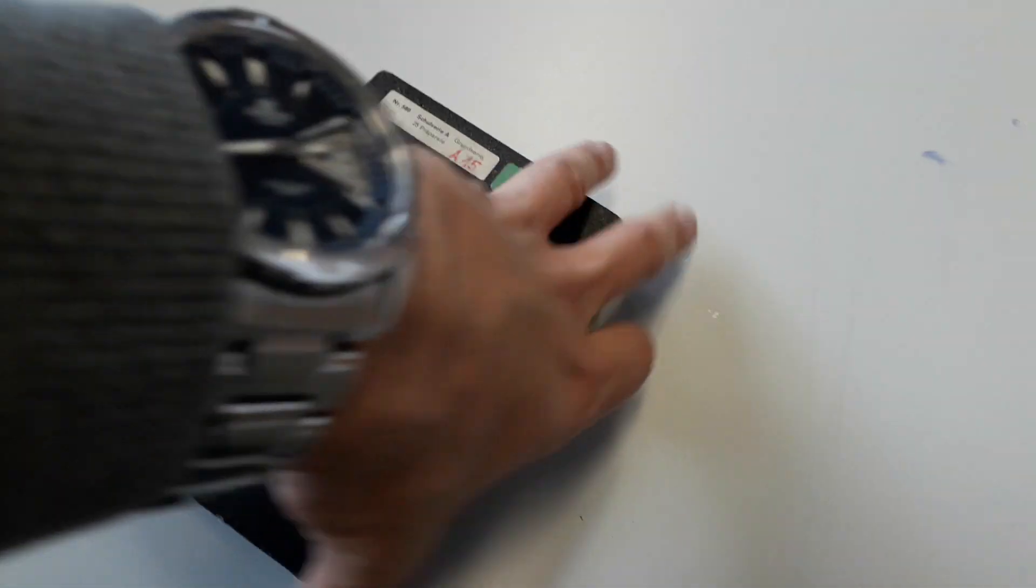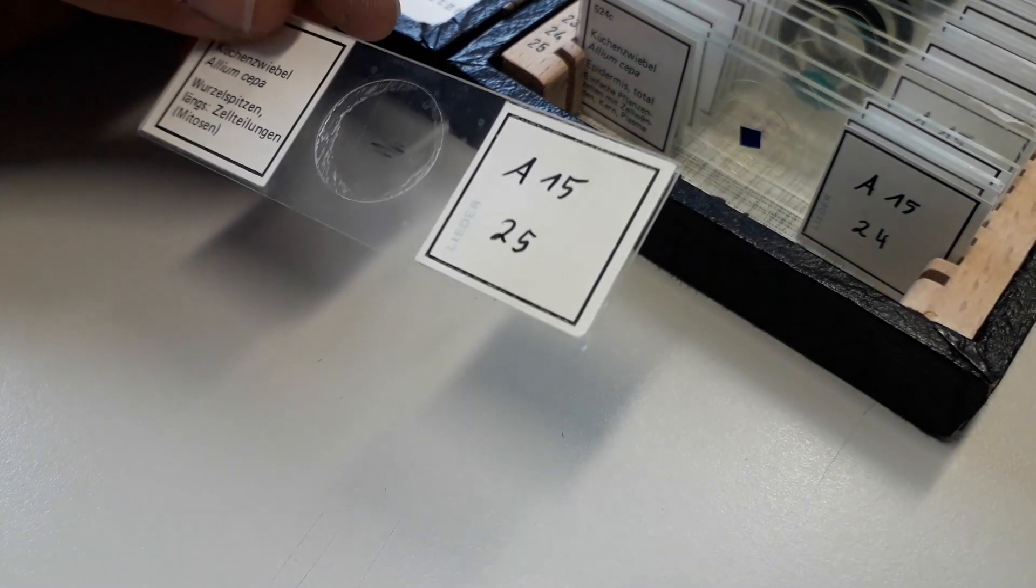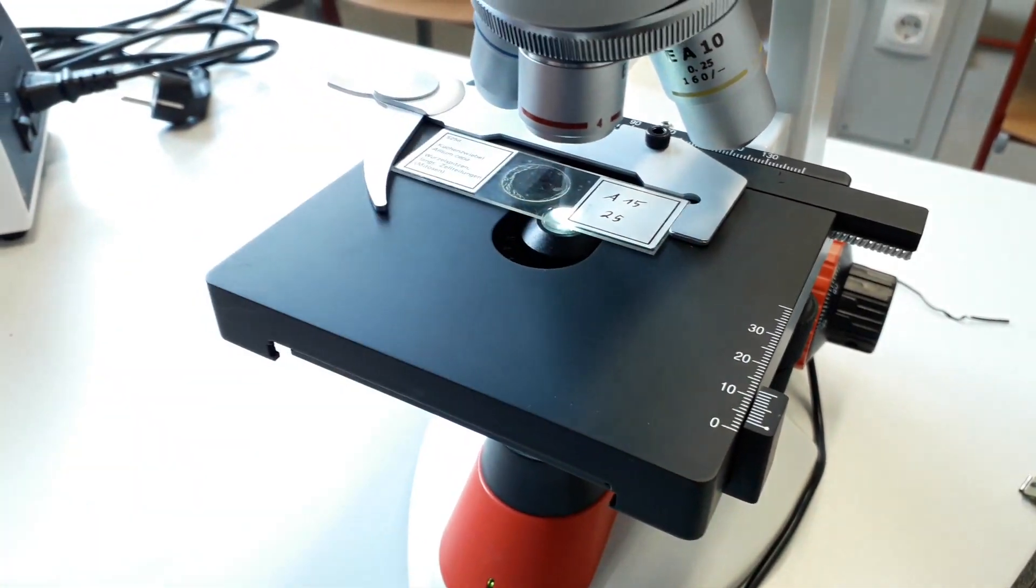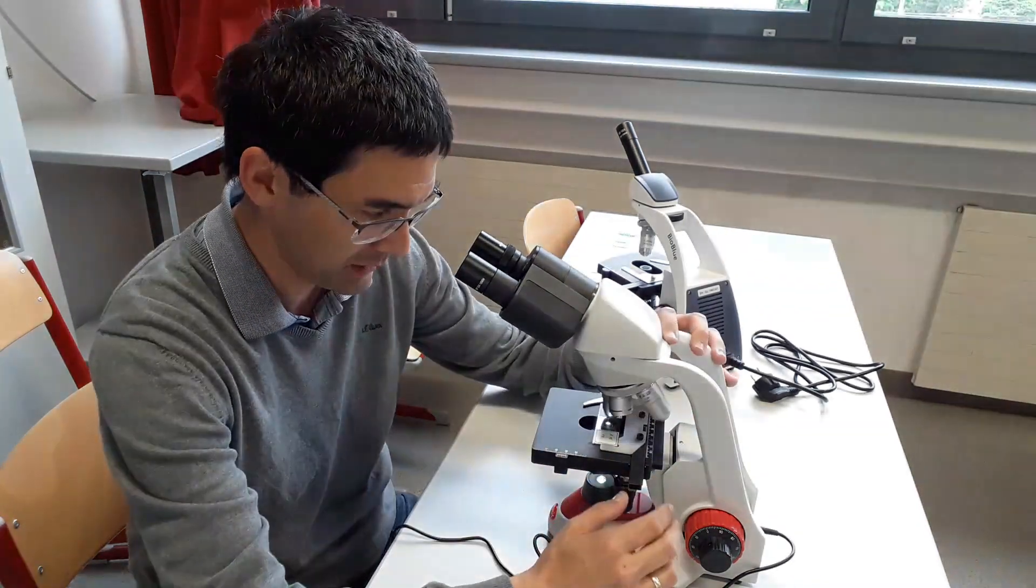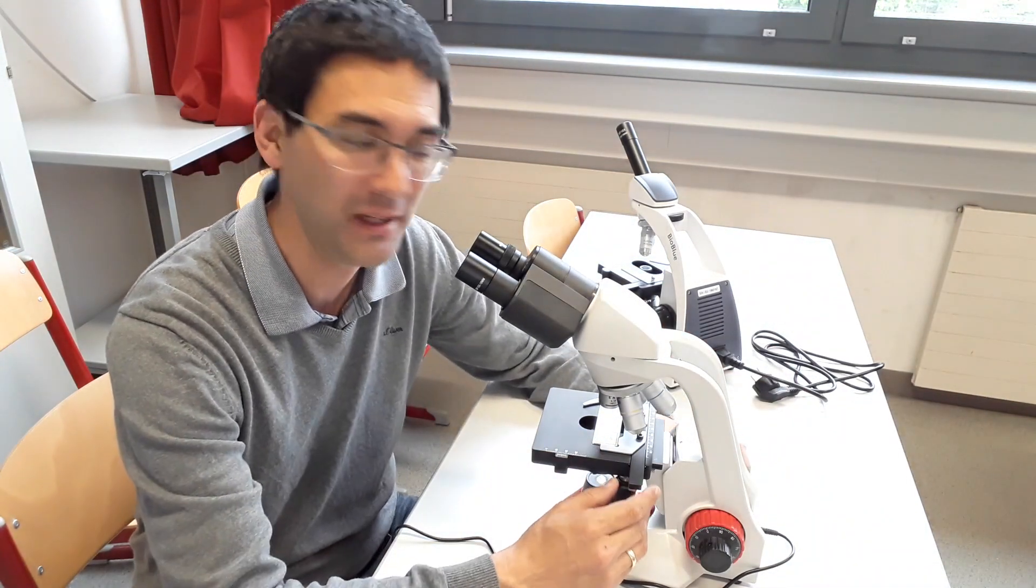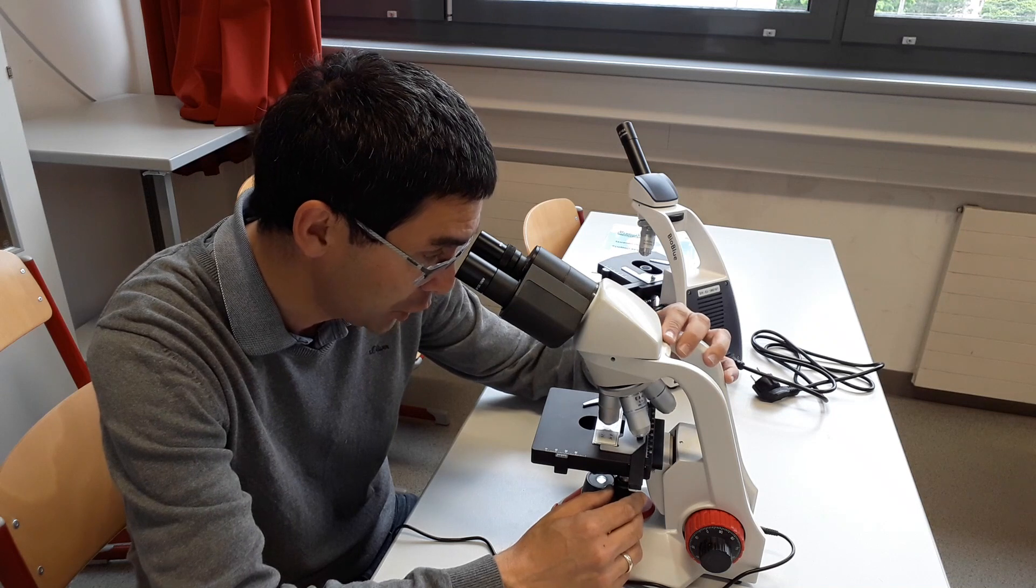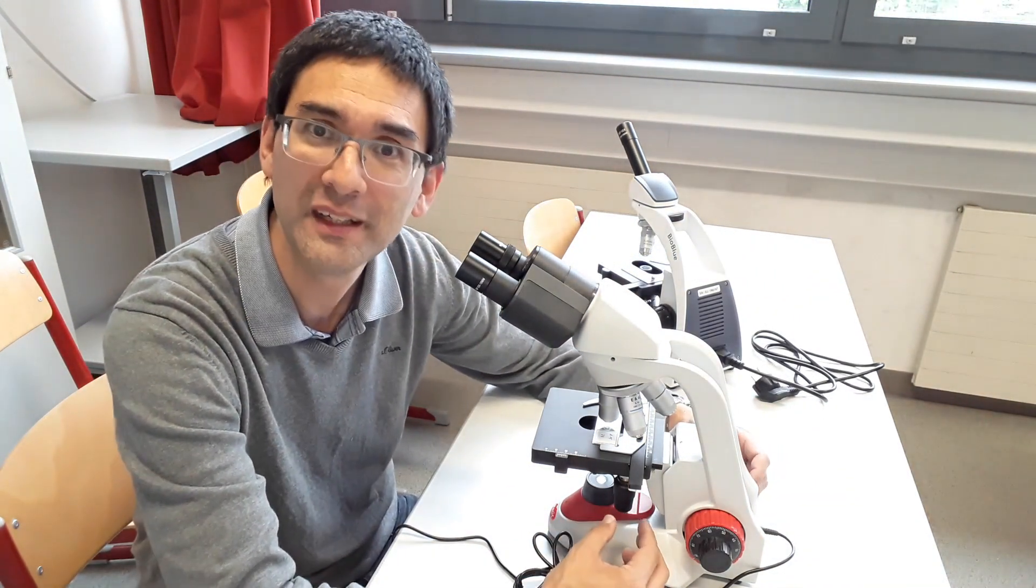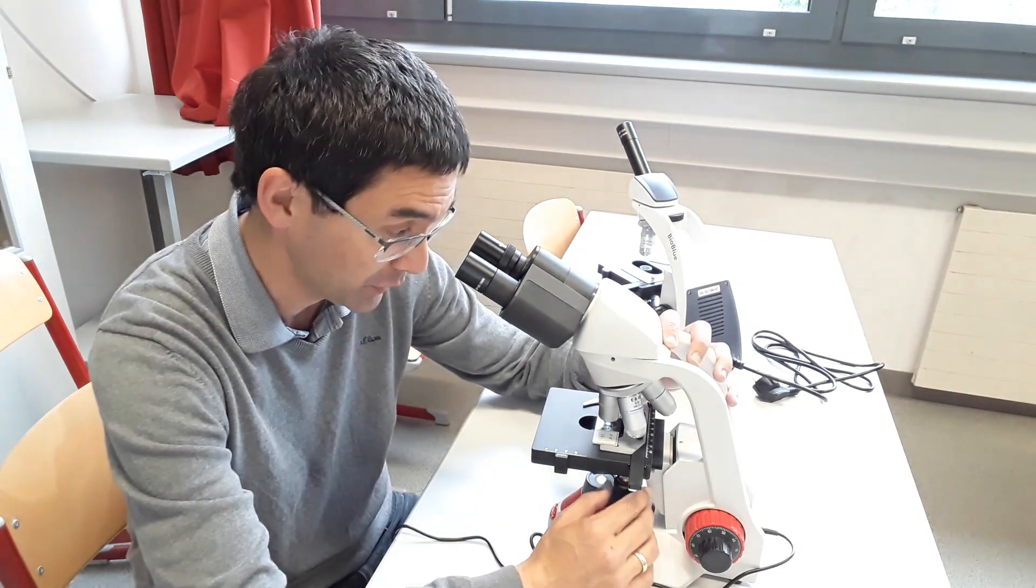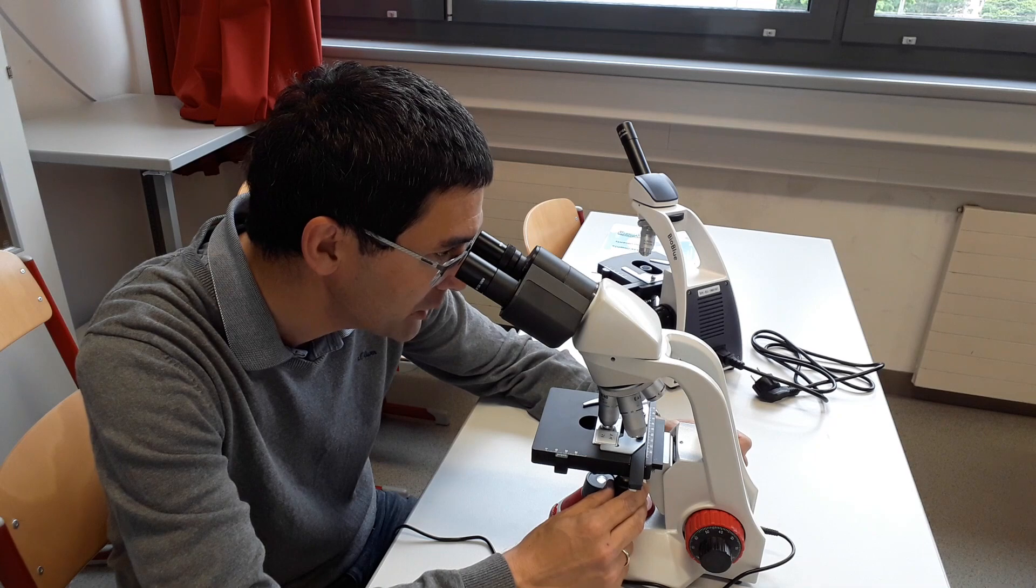This one here shows me some cell divisions. That's the tip of an onion root. And I should be able to see some cell divisions here. So what I'm going to do now is I'm looking at some cell divisions from an onion root tip. I'm going to simply then later on also show you what I see. So that is basically with 40 times total magnification. Of course, very nice picture, very clear. The objectives are all clean. The ones that we've been using so far on the current microscopes, basically the objectives are a little bit dirty already or the students have improperly cleaned them. Students should never clean objectives. It's always to be left up to the people who actually know what they're doing. But that's the reason why I see very clear, a very clear picture of the cell divisions.